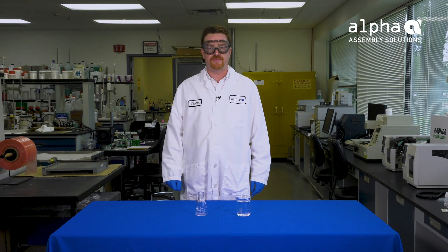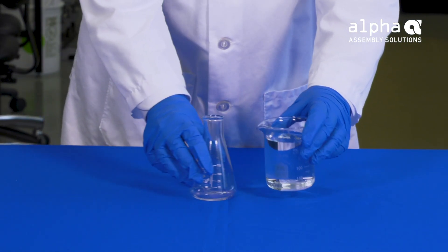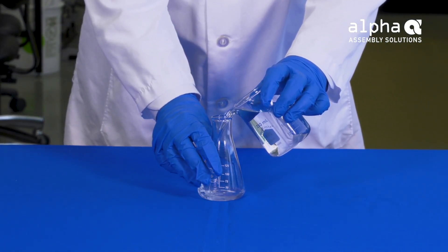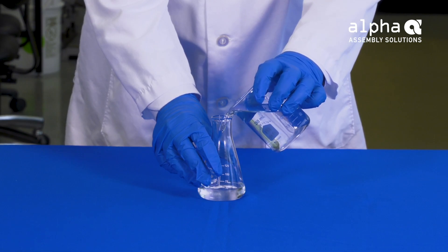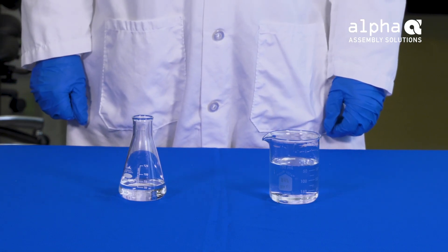Next, we need to add solvent to the test solution. Add approximately 50 milliliters of the appropriate test solvent. Today, we are using a 75% isopropanol, 25% deionized water solution. The volume of this solution is not critical and any variation will not affect measurement accuracy.